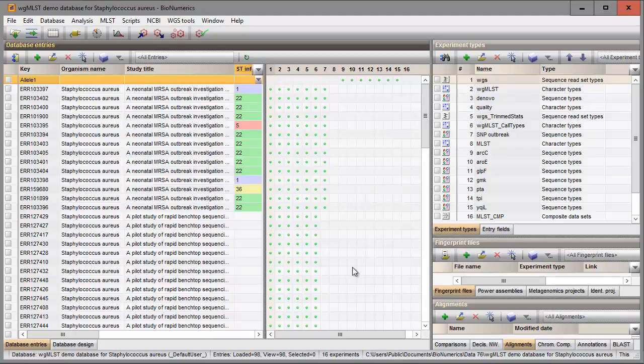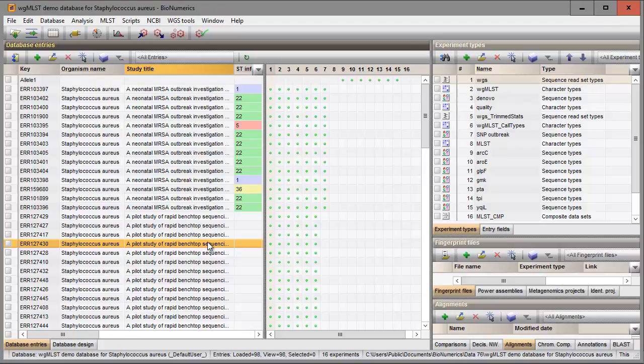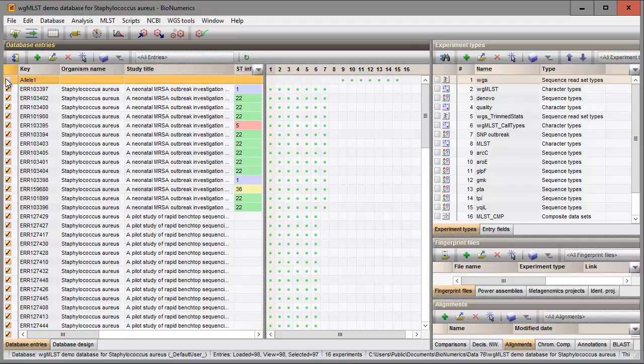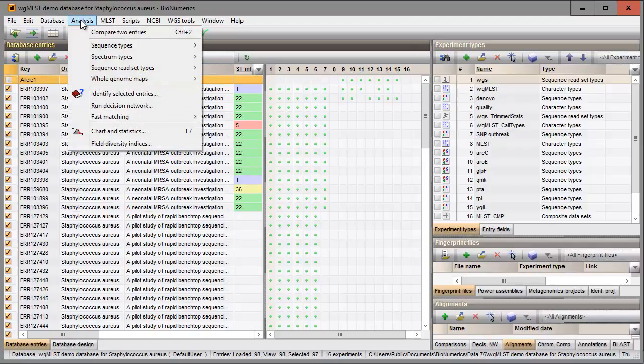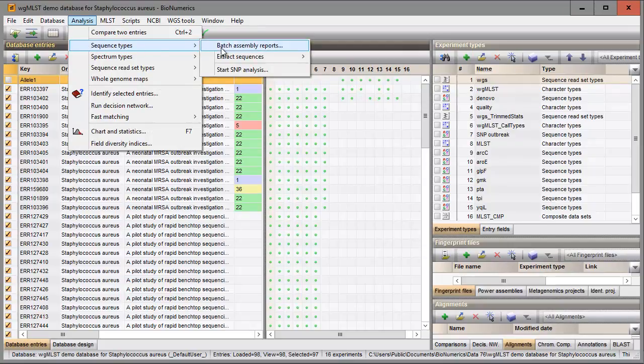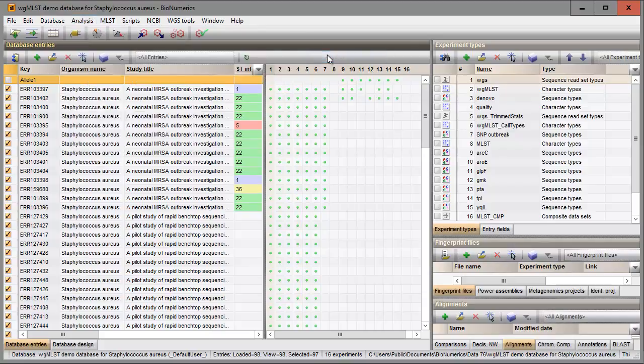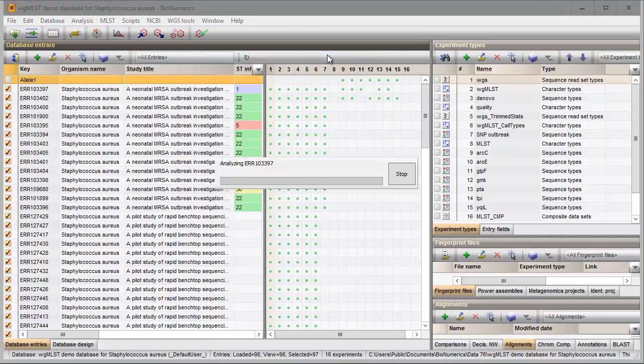I can now start the actual sequence extraction process. I select all entries in my database using the Ctrl-A keyboard combination and I unselect my query sequence. I now select analysis, sequence types, extract sequences, analyze to start the extraction process.